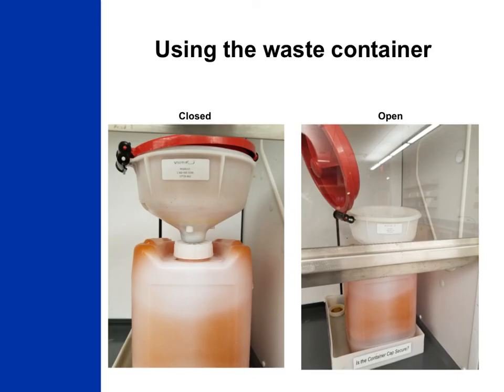Remember, when you go up to the hood to pour your waste in the waste container, to check to see if the lid of the waste container is opened or closed. If it's closed, please make sure you lift it up before you pour any waste in.